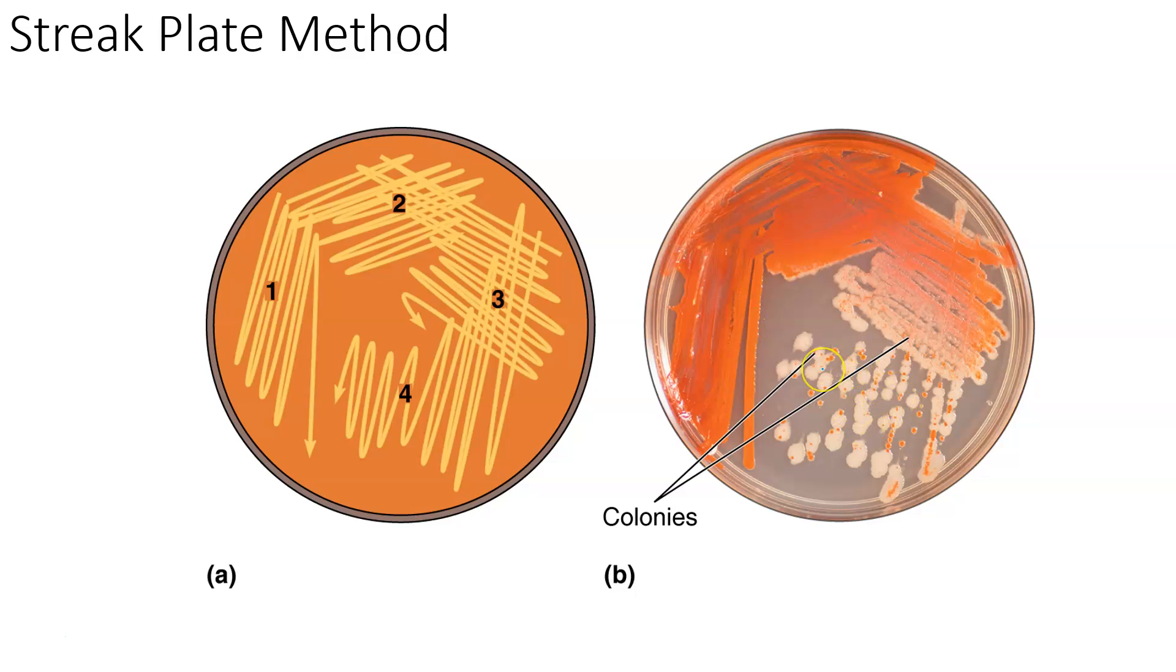Now the reason I like to show this particular sample is that you will notice that some of these are actually yellow colonies or I should say white colonies and some of them are this kind of pinky red color colonies. It is very likely and very common to actually have more than one strain of bacteria in a particular sample at once.